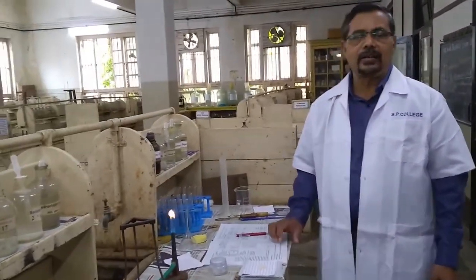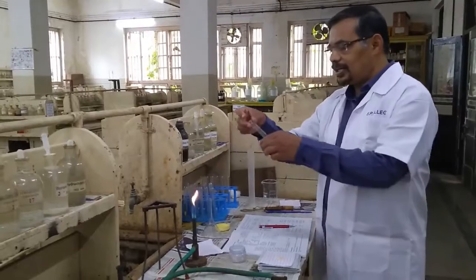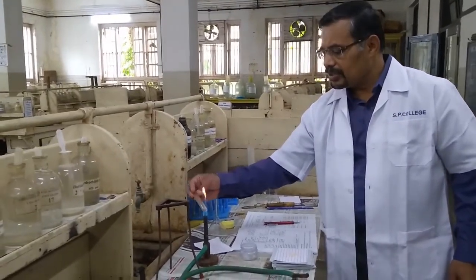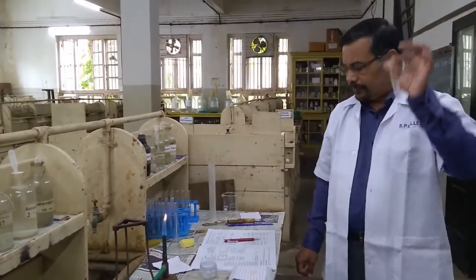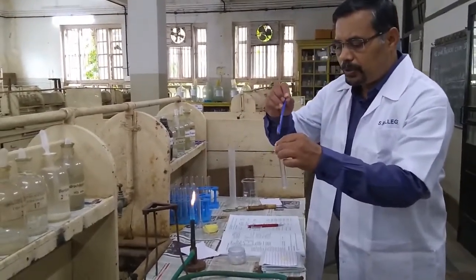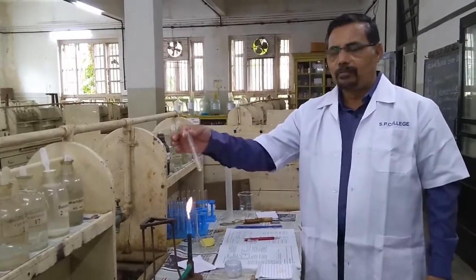The second step in the analysis of basic radical is to study dry test for basic radicals. For the dry test, we will take this one dry test tube. If it is not dry, then we will make this dry using burner. So this is now dry test tube. Now we will take small quantity of this given mixture in the dry test tube. So put this small quantity of mixture in the test tube. Then we will heat this with the help of burner.